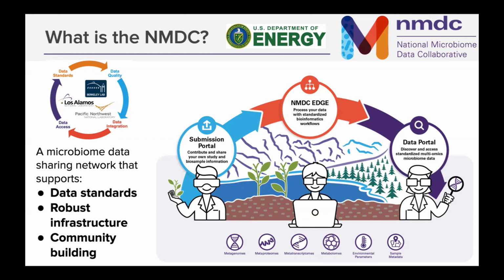But one thing about the NMDC Edge is that it gives you standardized bioinformatics workflows, which means it gives you a workflow where you can just run your data without having to make multiple clicks. For example, if you are running the MAGs workflow, all the software or the tools that are involved are standardized, so you don't have to select anything. In that way, if you use a particular tool and other scientists working in the same field also use the same tool, you're probably going to get the same results and communicate in the same language.